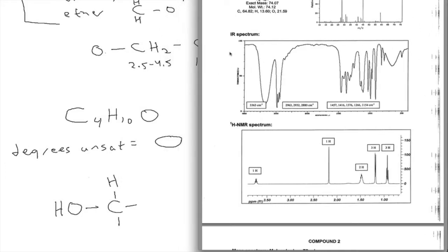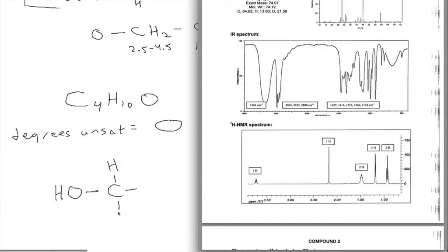So what I'm trying to do on this problem is demonstrate a method for working this out. The method is to start by focusing on finding the functional group and then try working away from the functional group. So now working away, I know what element this is. Carbon. How do you know? Because that's the only thing left. It can't be a hydrogen because remember this had an integration of 1. And how many bonds does this carbon have? 3. So I might as well draw them in. All these little steps can help us here.